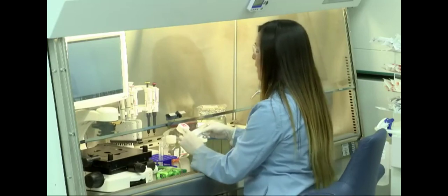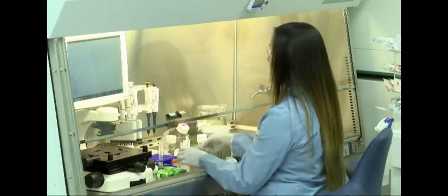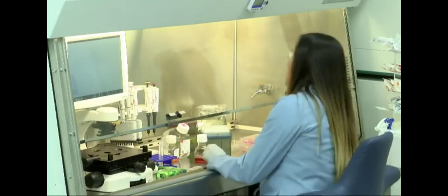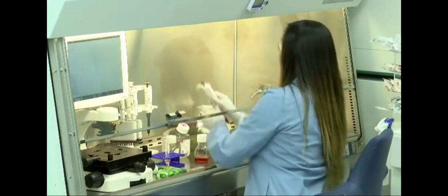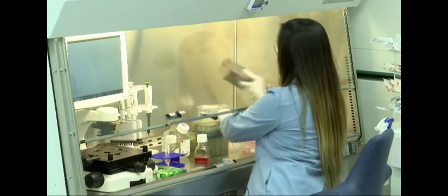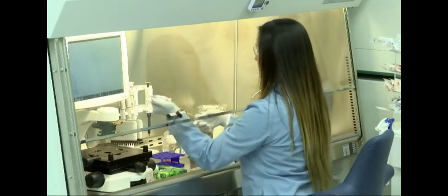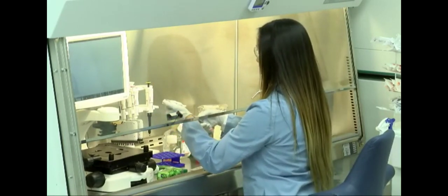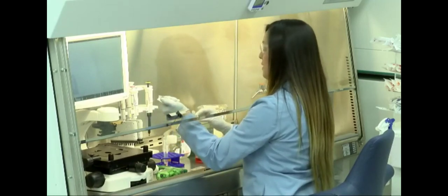So we have our Countess 2 I'm going to use. We actually have these pre-made Countess 2 slides, so I'm just going to rip it out of the package. And then I'm going to take 10 microliters of our cell suspension and add it to 10 microliters of Trypan Blue.